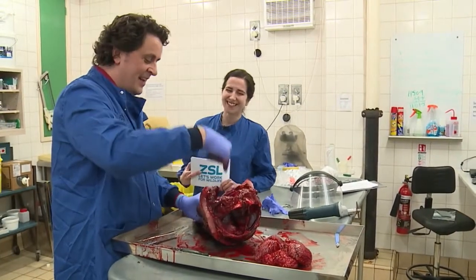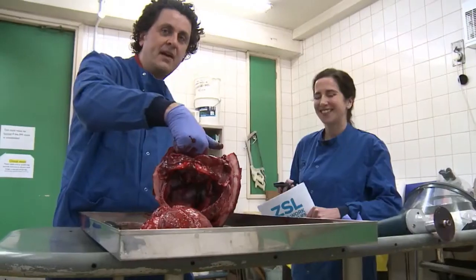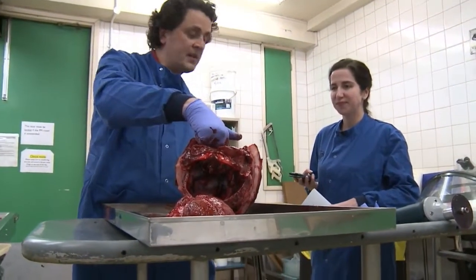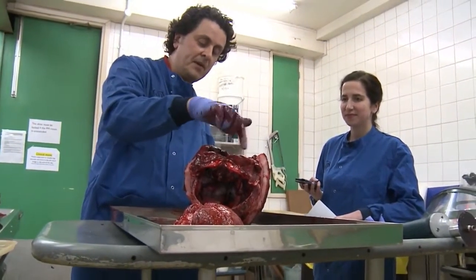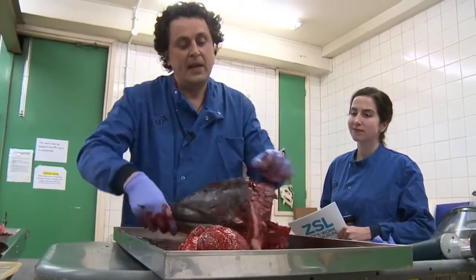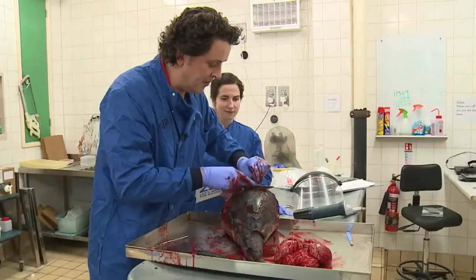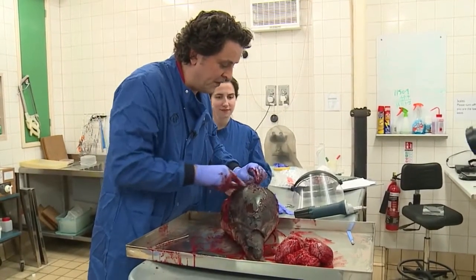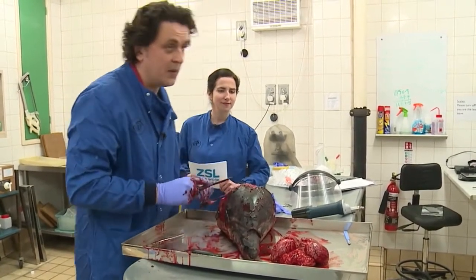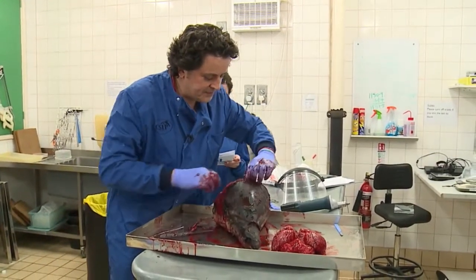At depth, they begin to echolocate by sending pulses of air up into the blowhole. There's a muscular larynx here, sphincter here that contracts and relaxes, sends pulses of air up into the blowhole. And then it goes past a set of structures called the monkey lips or phonic lips. This is very quick because we've got a couple minutes left and crude dissection.